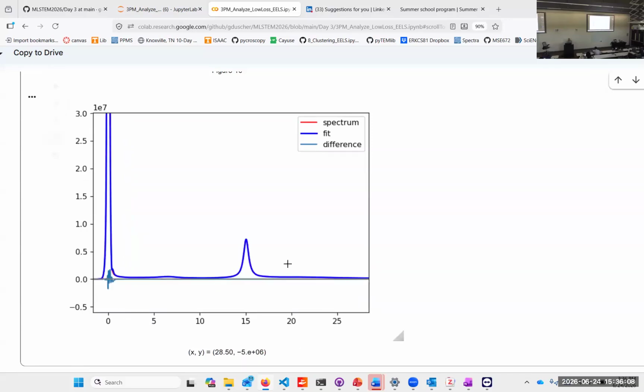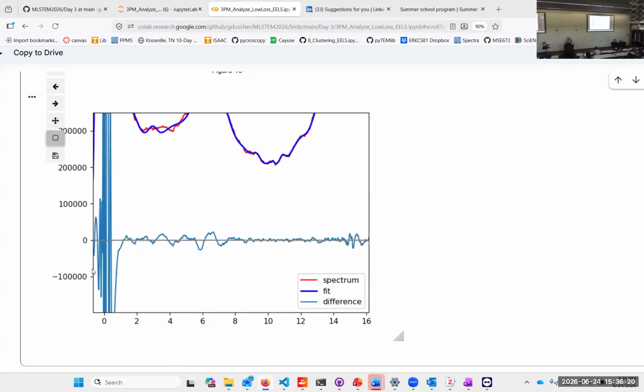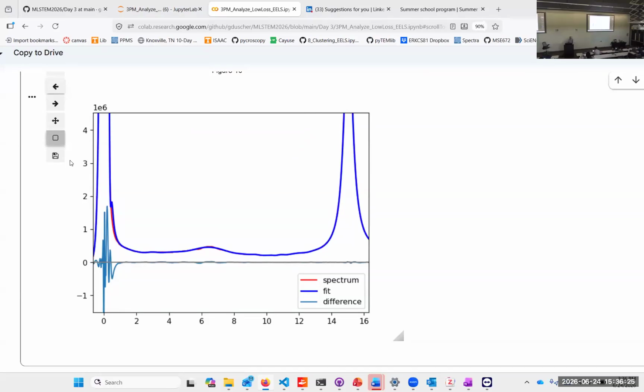low loss peak now. We have the multiple scattering, and we have a representation of it, so this is our error here. It is reasonably small. We can discriminate it nicely. And we can now interpret the different parts. We have all the Gaussians to do that. You can reduce the number of Gaussians and fit it again so that you have really representative parts of that.